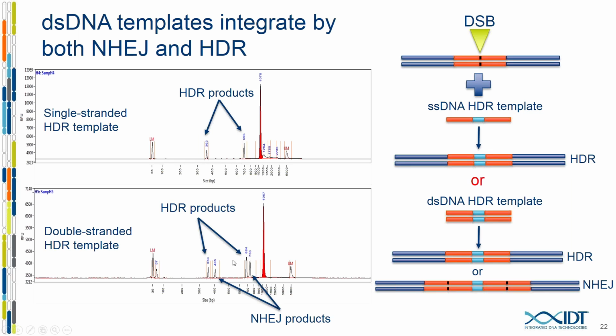So this is, of course, not what you want in most cases in the experiment. So when you can, single-stranded templates tend to avoid this issue entirely. We haven't ever seen this type of product with a single-stranded HDR donor.